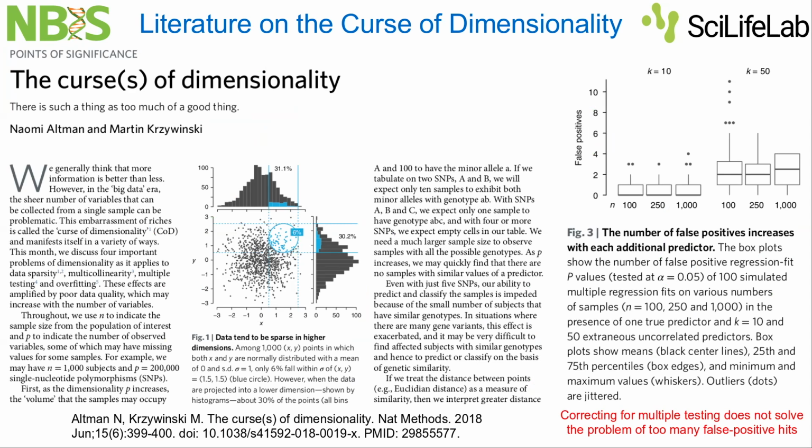So the major obstacle here is a common statistical pitfall called the curse of dimensionality, and that's literally problems with convergence of equations when the number of dimensions exceeds the number of statistical observations.